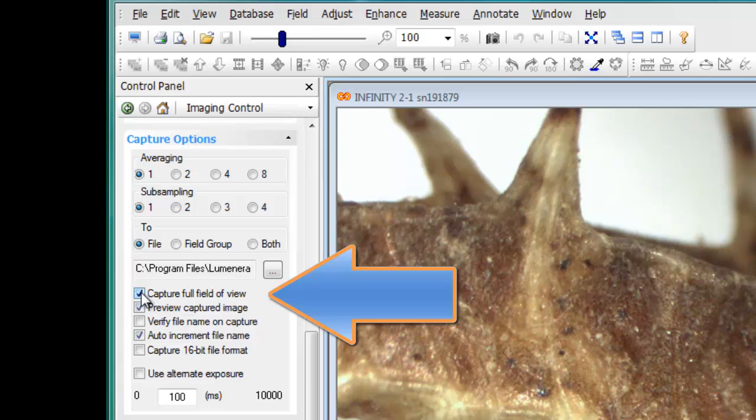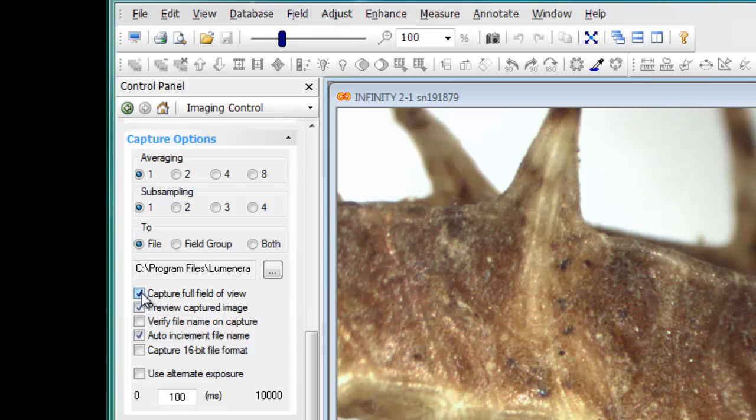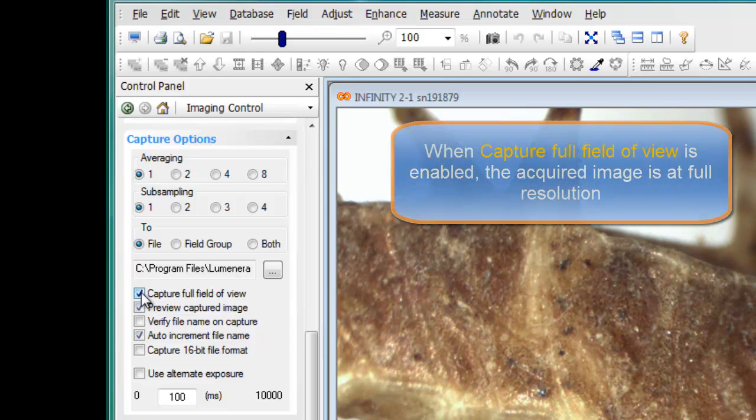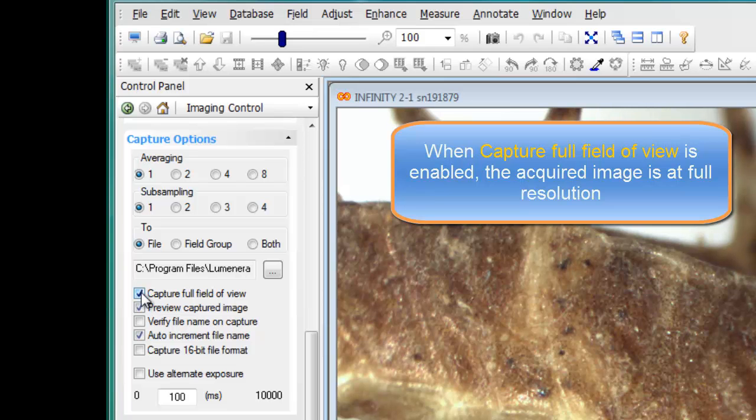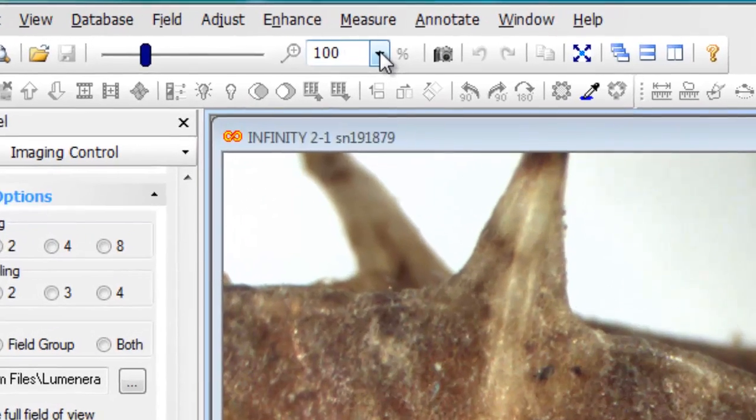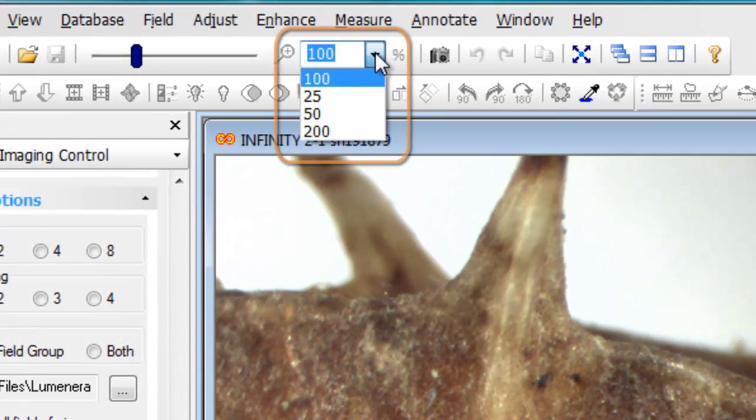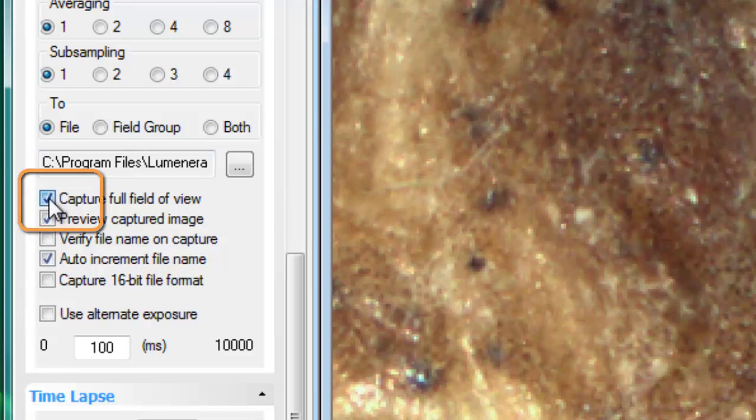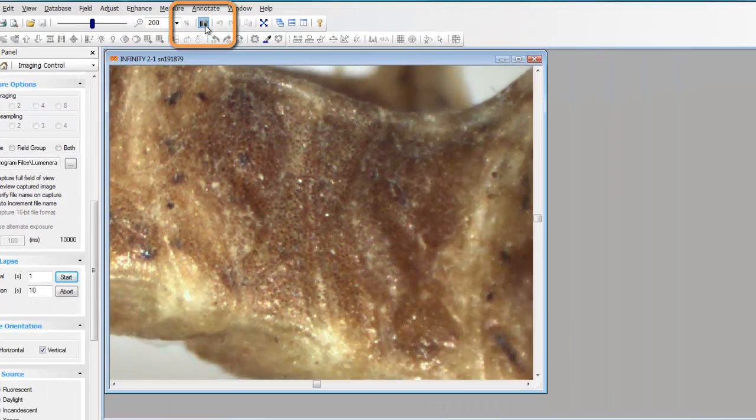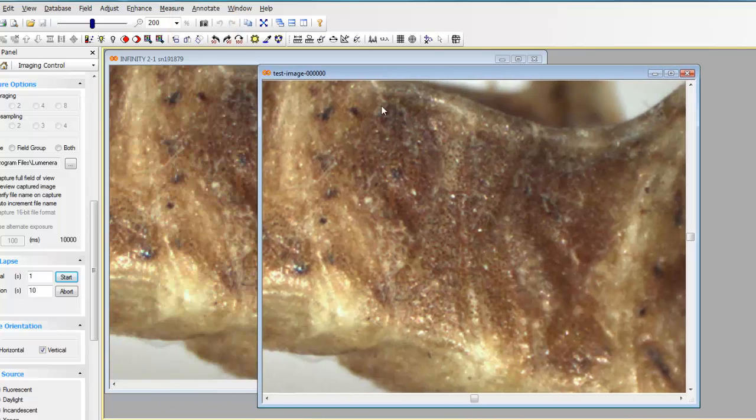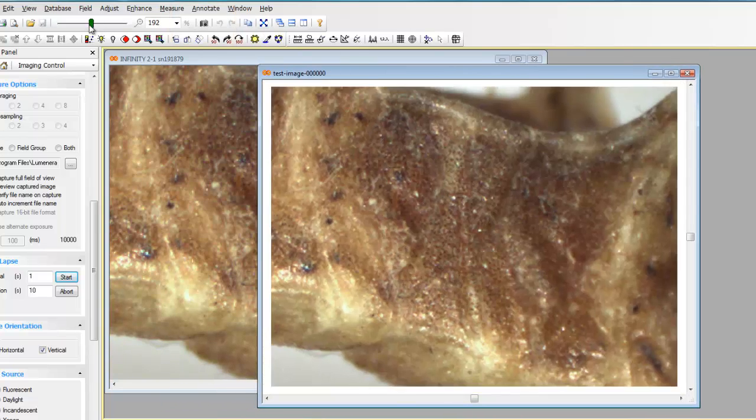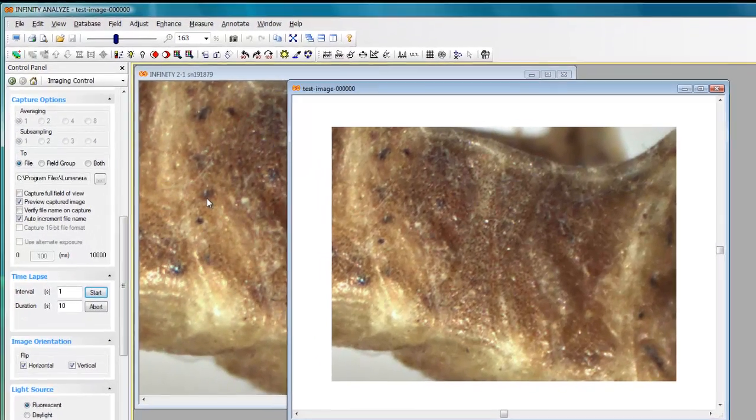The capture full field of view specifically tells Analyze that you want to capture the entire resolution from your camera, whether it's a 1.5 megapixel, 2 megapixel, 3 megapixel, or 5 megapixel camera. Capture full field of view when enabled will always take the image of the entire field of view. However, if you remove that checkbox and change your live preview zoom scale and now click on the capture button, you'll see that the image captured here is showing me just the portion of the image that was visible in my live preview.